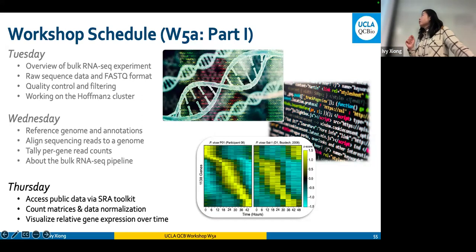And then we want to go through a little bit about how we deal with the count matrices we have generated from the pipeline, especially when you have multiple samples and you want to compare between samples. Let's say the same gene, can we actually compare it in a fair and well-controlled way? Especially some of the samples will have more sequencing depth and they have more mRNA to begin with. We have to account for these kinds of biases in sample quality.